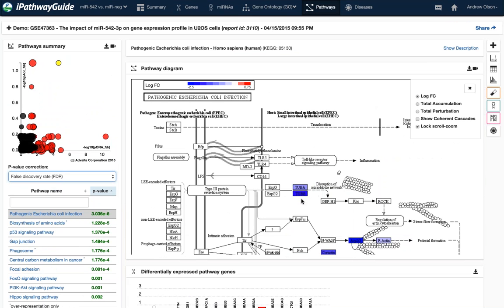So as we mentioned, we look at how the genes are connected in this particular system. So here we have the fold change, but we know that the pathway describes a downstream relationship. So when we assess the topology, the downstream component of that, by looking at the total perturbation accumulation, that's the downstream accumulation of this fold change, we can see that we have a number of genes that are predicted as having some type of change in expression. So when we look at the total system perturbation, we look at what was measured plus the downstream component of that.